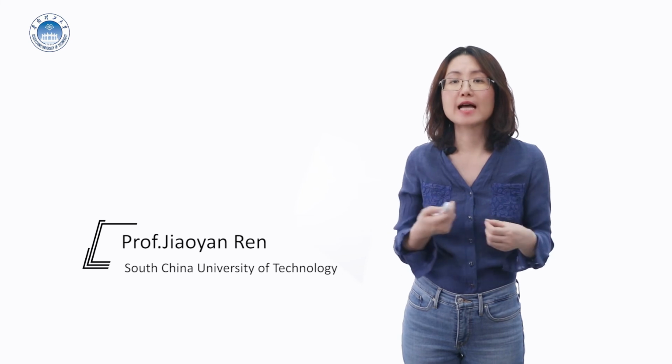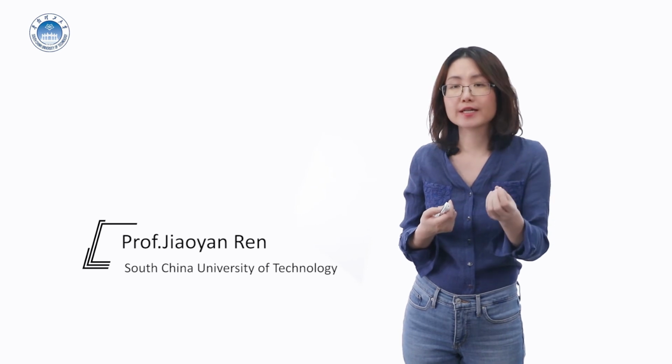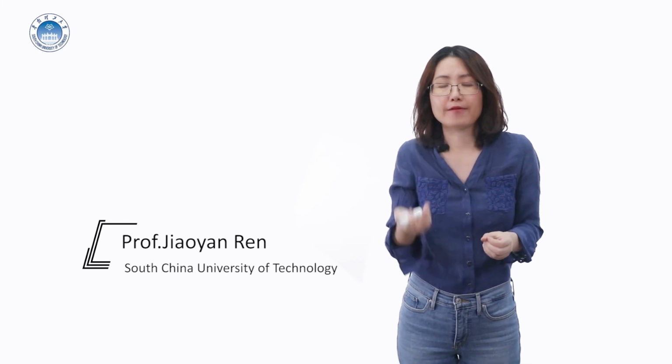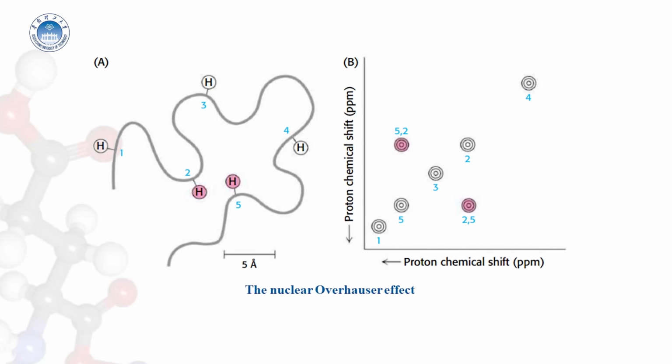By inducing a transient magnetization in a sample through the application of a radio frequency pulse, we can alter the spin on one nucleus and examine the effect on the spin of a neighboring nucleus, especially revealing a two-dimensional spectrum obtained by nuclear Overhauser enhancement spectroscopy, or NOESY, which graphically displays pairs of protons that are in close proximity, even if they are not close together in the primary structure.